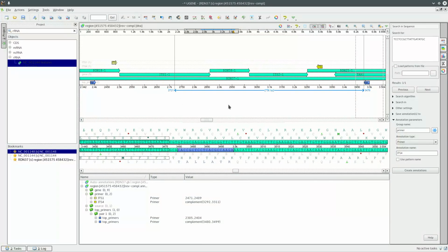So I know that I'm going to get reliable sequencing data from both of these primers for the whole ITS1 and ITS2 sequences. And empirically, I've always had success using primers that Primer 3 has chosen for me, so I'm inclined to use those.